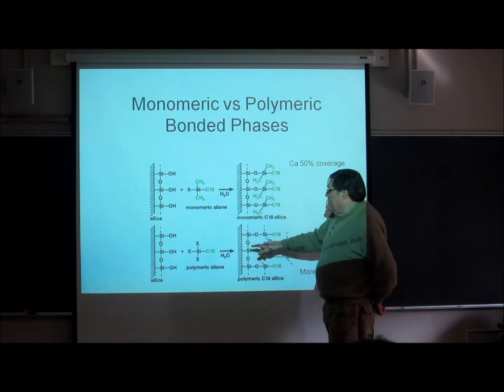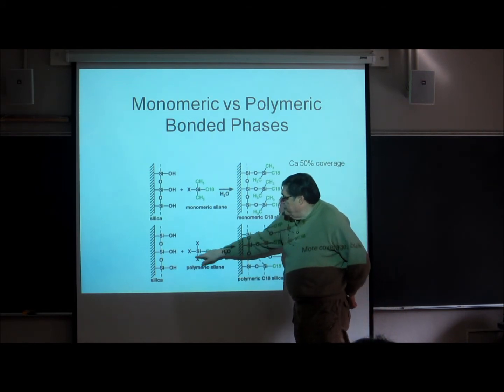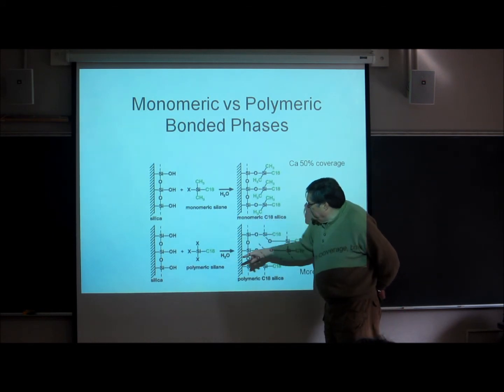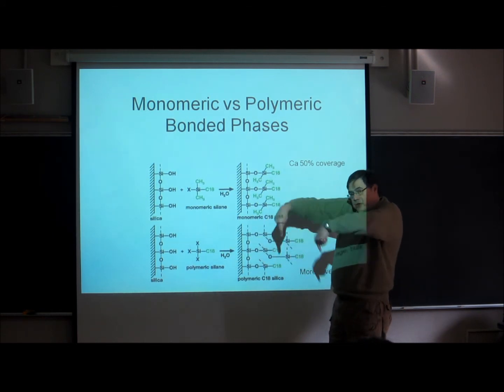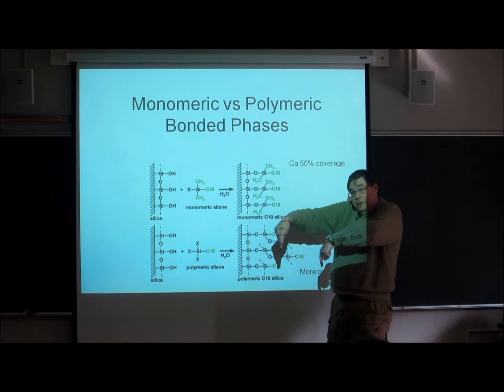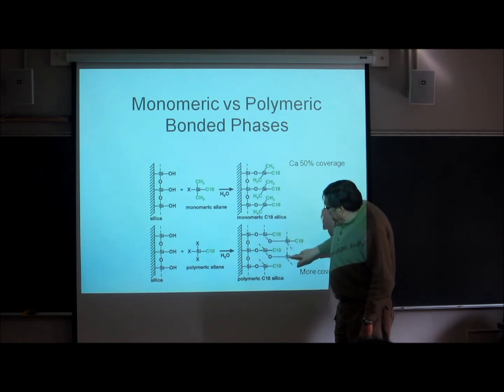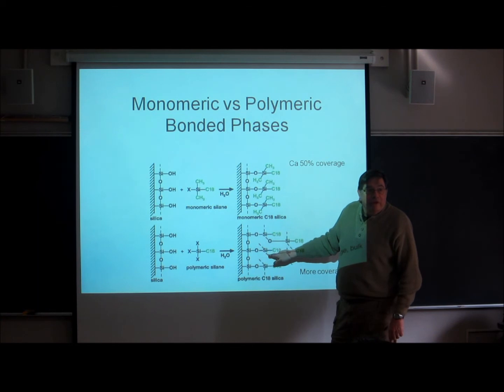And this shows a polymeric silane, either 2 or 3 chlorines on this. And when you have more than one site, you can either go down and bridge 2 silicons, as I showed you before, or, it's going to be hard to bridge 3. What you can do is have another silicon come in and bond to a silicon that's in place before a bridge forms.